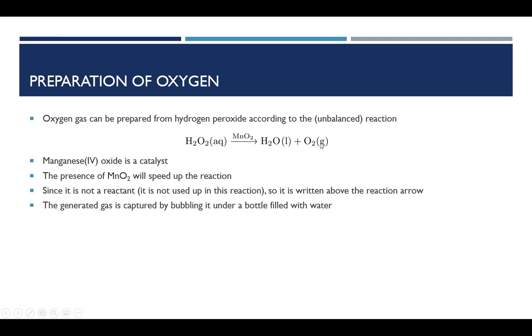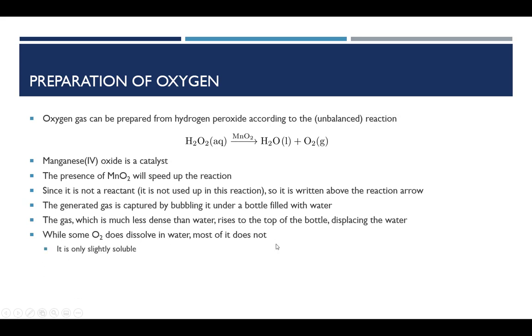The oxygen that's produced has to be collected in some way. We can't simply just wave the flask right over the decomposing hydrogen peroxide, because that's going to push a lot of air into the flask as well. So we use a technique called collecting a gas over water. The gas is bubbled through a tube of water, and the gas will then bubble to the top of the bottle because the gas is much less dense than the water and the gas is not very soluble in water. Some oxygen does dissolve, but most of it doesn't. It is said to be only slightly soluble. O₂ is a nonpolar molecule, and we know that water is polar. So we wouldn't expect oxygen to be very soluble.